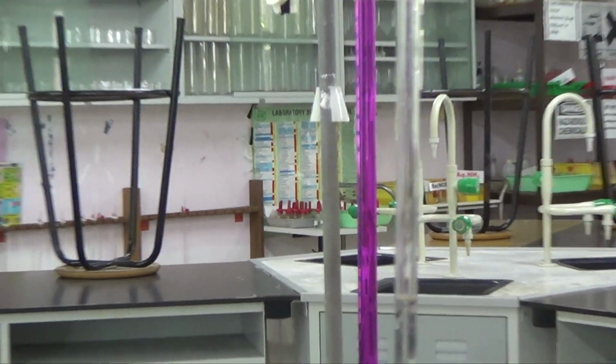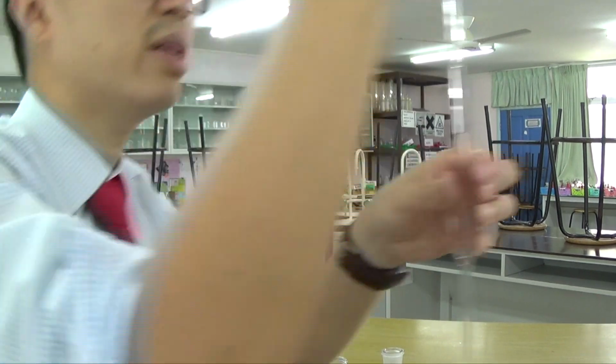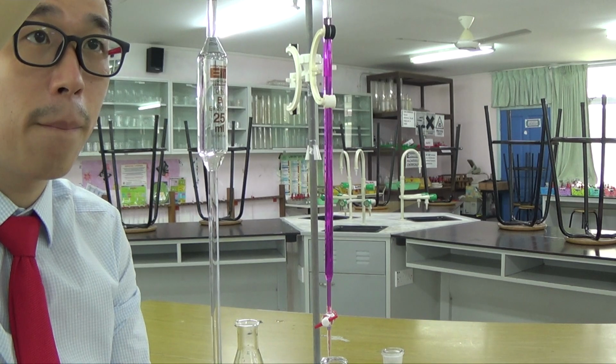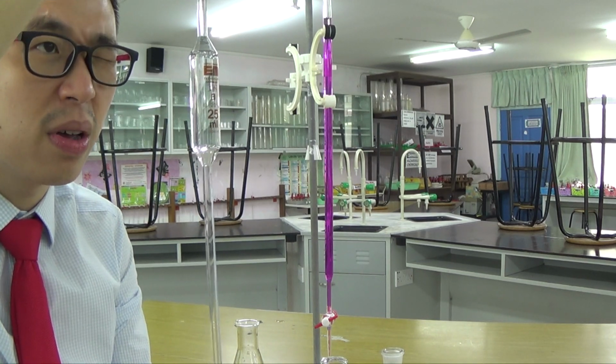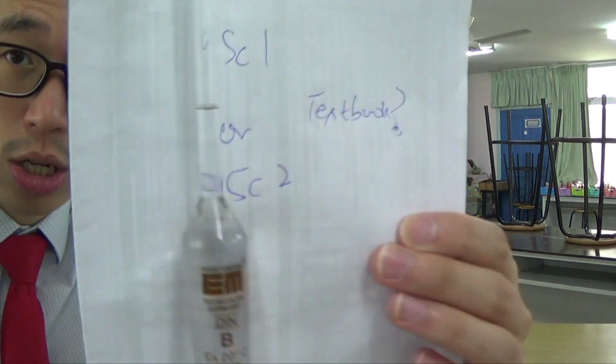So this is my pipette there. I'm just going to eject out here. We read below the meniscus because this is not a colored reagent.